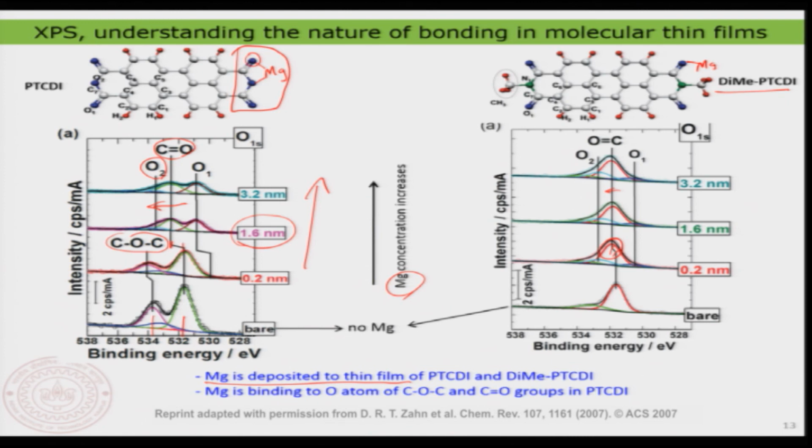Yeah? So, in terms of the molecule-molecule interaction and the molecule surface interaction, that is also the reason why I have discussed with you the case of carbon monoxide on different surfaces. You have seen there we can even understand the interaction of the molecule with the surface, and this is of course a case where I am talking about a thicker film, therefore, the molecule surface influence is unimportant. That is also something we have seen in the case of UPS. If you recollect, for this molecule we have also done a thickness or coverage dependent experiment. There you already have seen that after a certain number of layers, you do not see any more the influence of the surface. Yeah? So, that is also something you have seen.